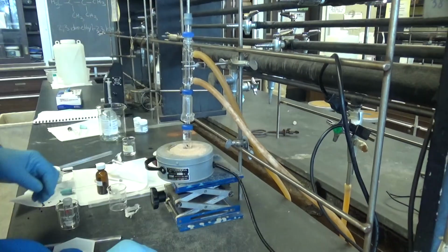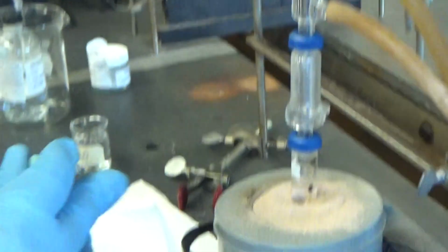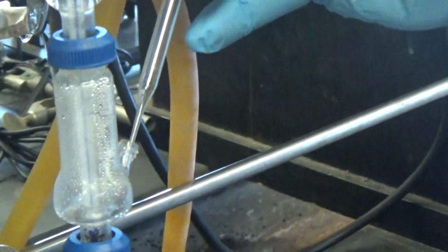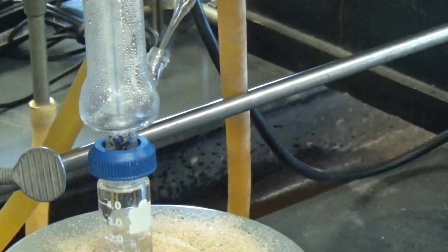Okay, so now you have a Pasteur pipette, and you're gonna suck it out the side port. Let me get a good view. Where are you putting it? Into the other conical? Put that here. Alright, and the next one. Just get all that liquid as much as you can. As much as I can. I don't think we have too much left there.